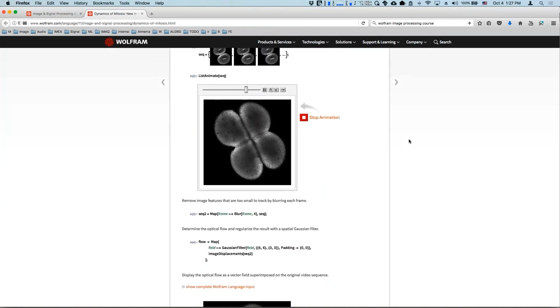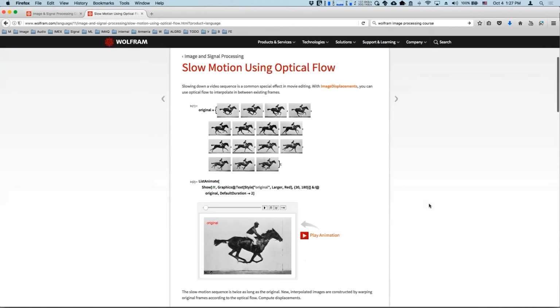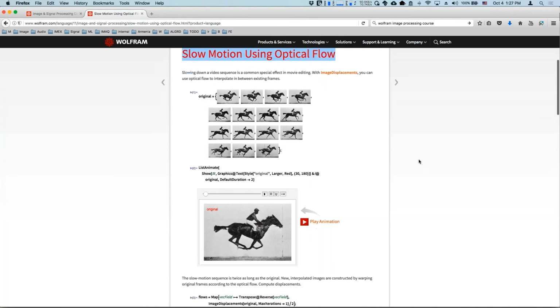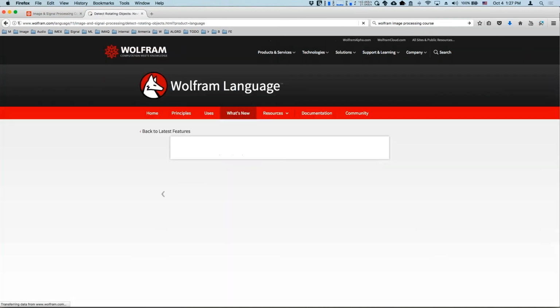This is using classical methods for dense optical flow. Typical ones are KLT and Farneback, and we have basically picked from all of those, looked into different implementations and picked one. This one is probably not so relevant for this talk, but we are doing some interpolation based on the displacement.